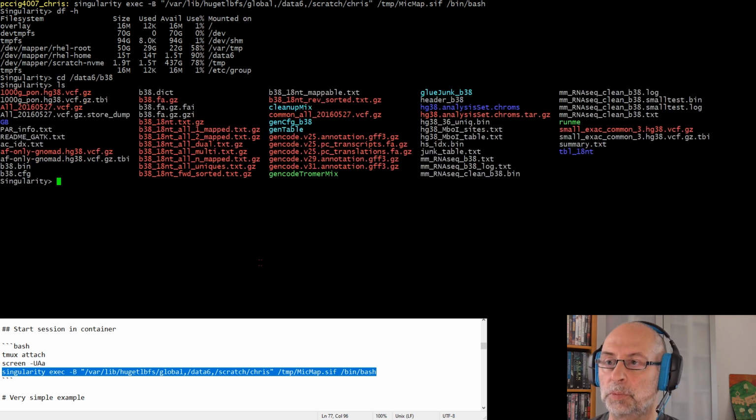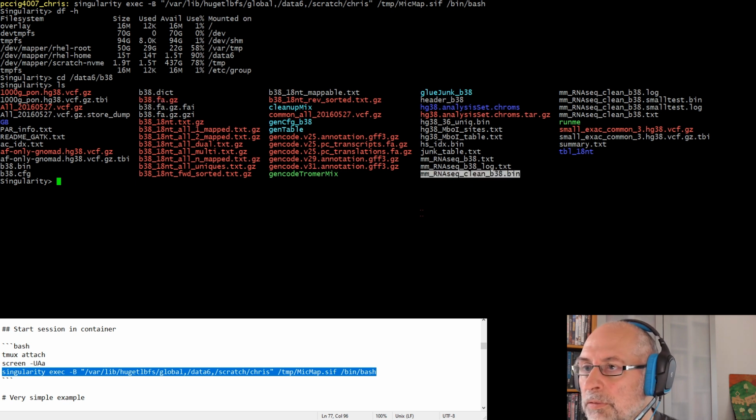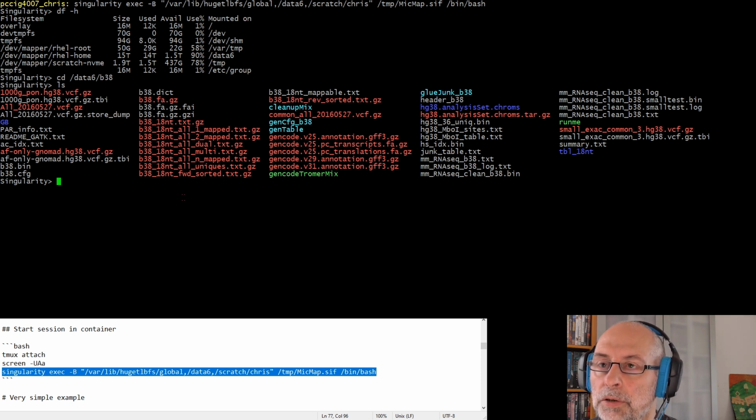there is, in my case, probably more files than will appear in your setup if you download it from the website, but a few important files are these: b38.bin.config, fasta, and also some references if you want to analyze RNA-seq data, which are files like this, which you will need. So B38 is the human genome version 38 with some extra decoy sequences. Basically, it's the one that seems to be typically used in other projects. So HG38 plus some other data that is useful to clean up basically the mapping.